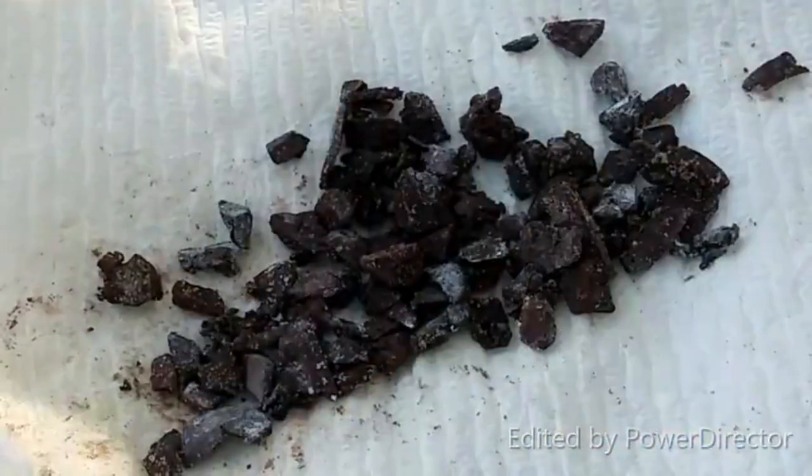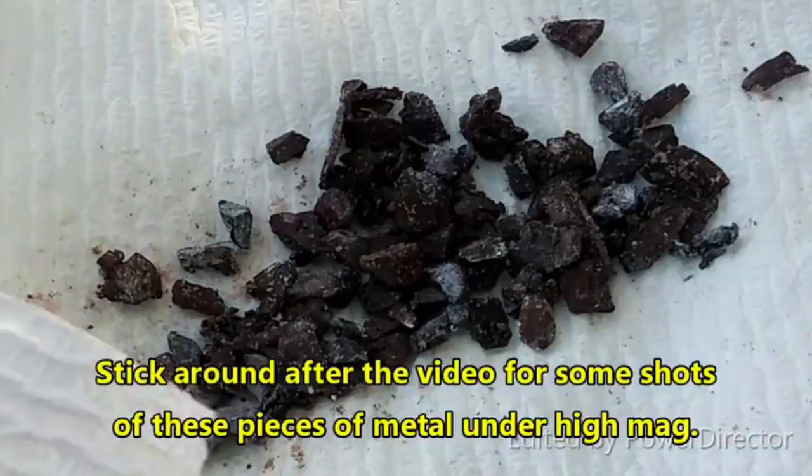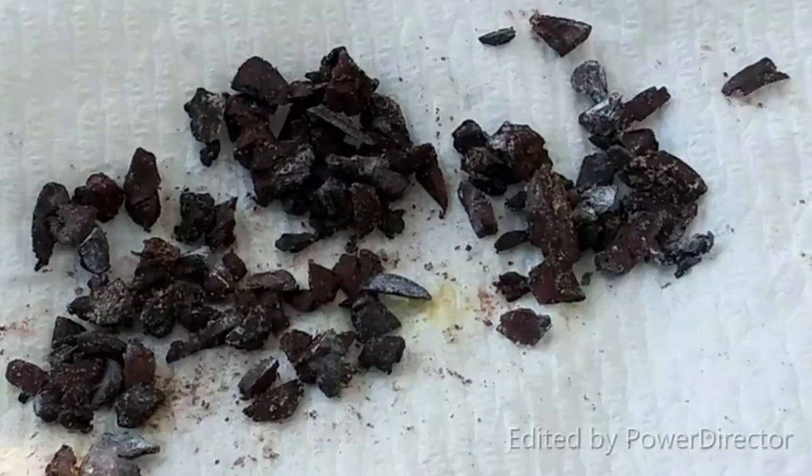I'm going to get them out of here and take a closer look at them so we'll be able to see exactly what we're dealing with here. That is really something else — that really is, that's so cool.